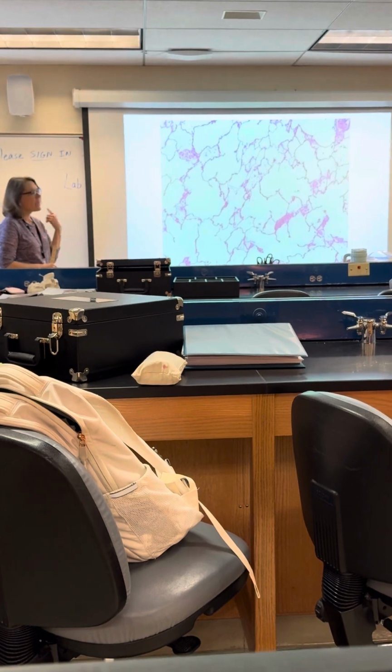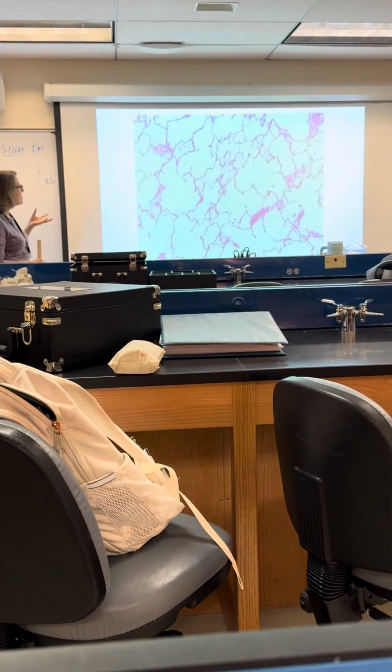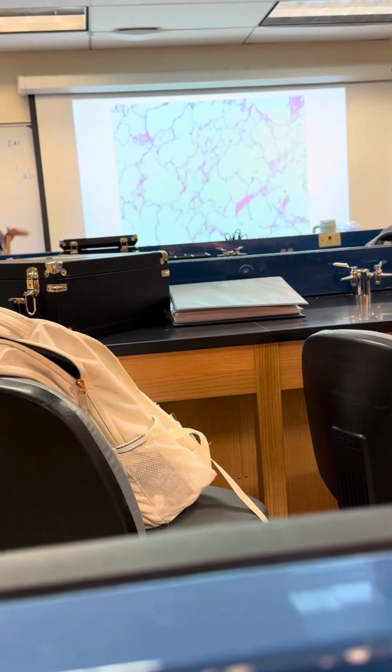When I'm doing mine in class, I always just show low power, and then the questions are asked on the high power so that you can see the cells involved. Do you guys remember, does this look familiar to you? What kind of tissue does that look like? Over the eye. So that would be simple squamous, what type of tissue? Epithelial tissue, good.